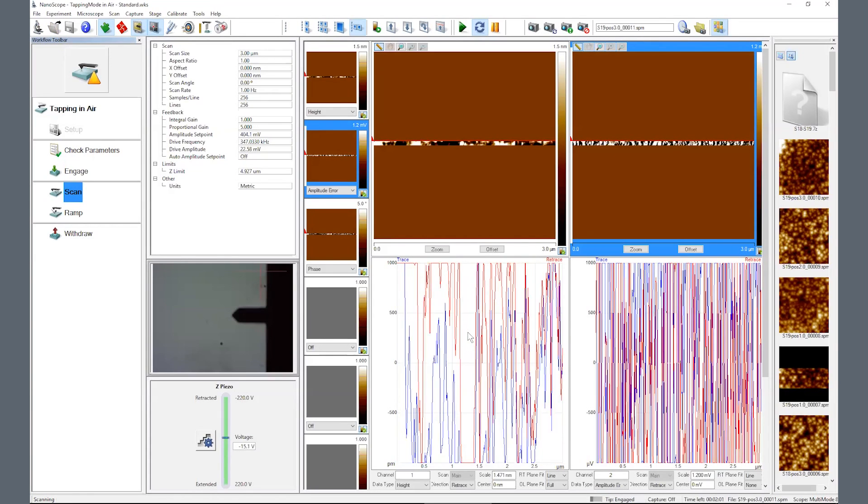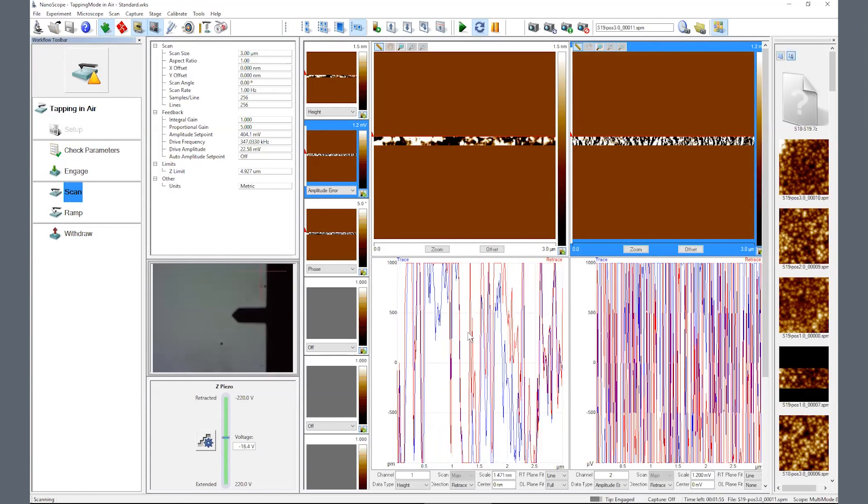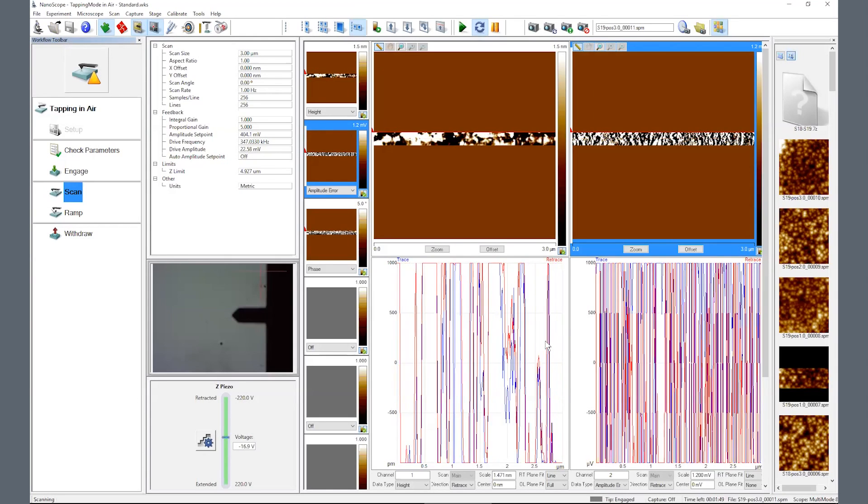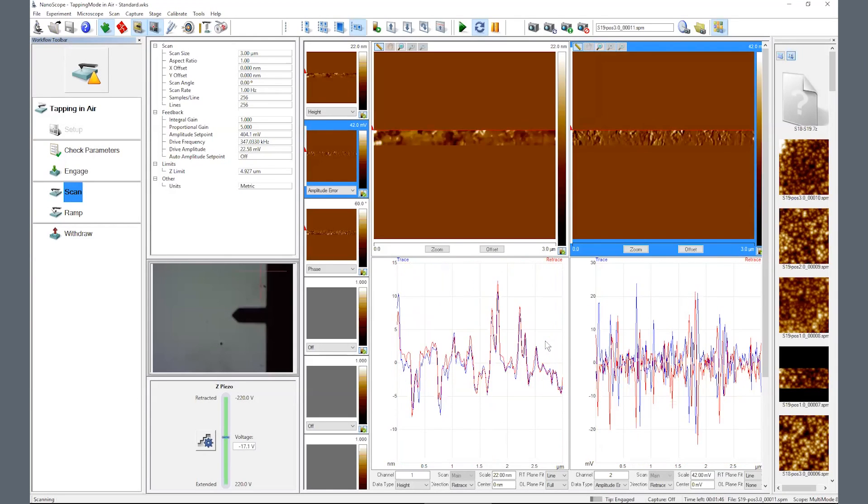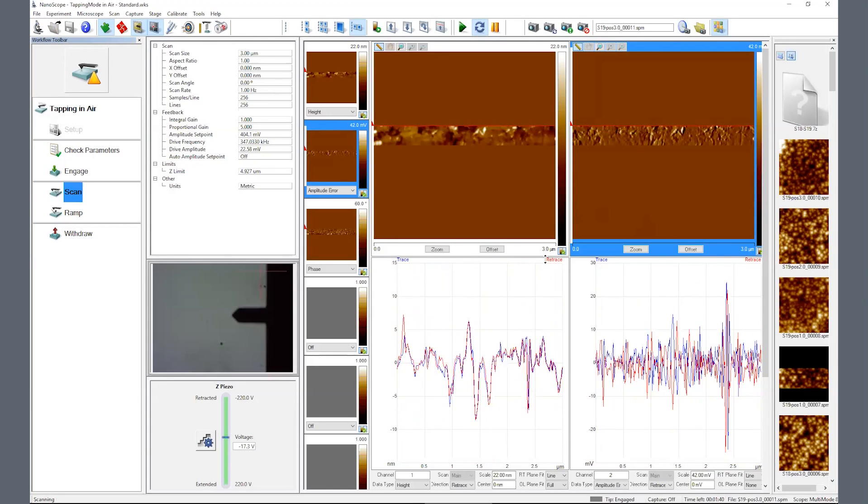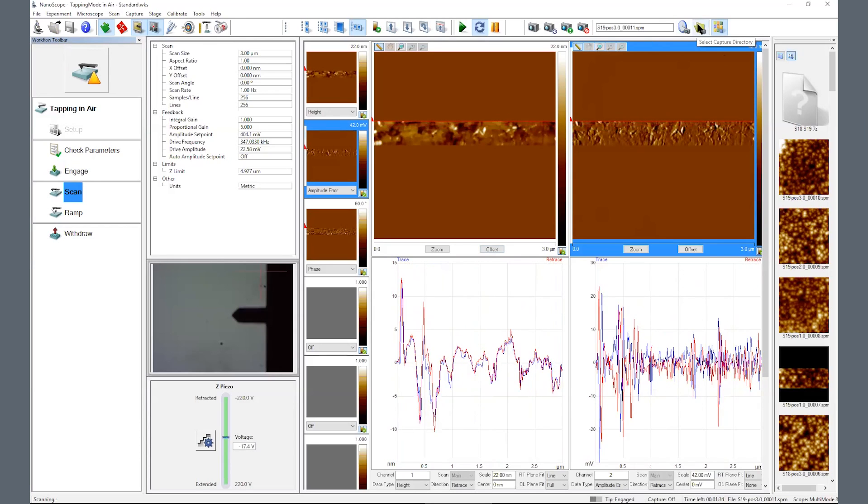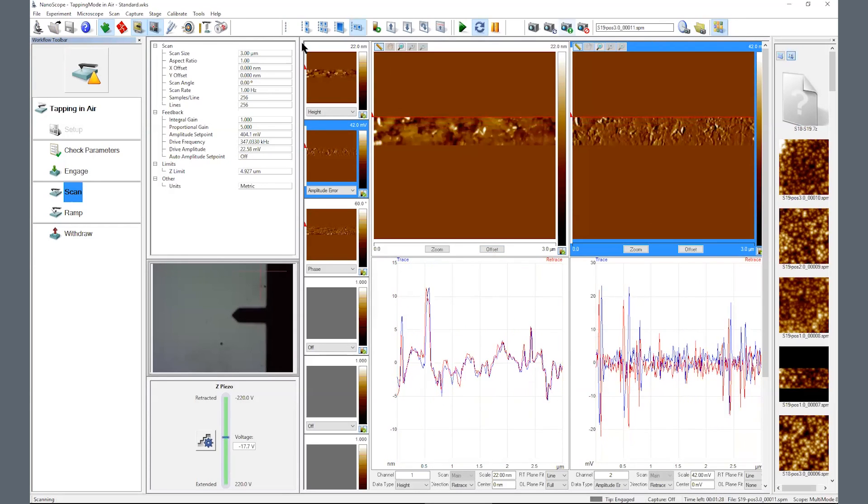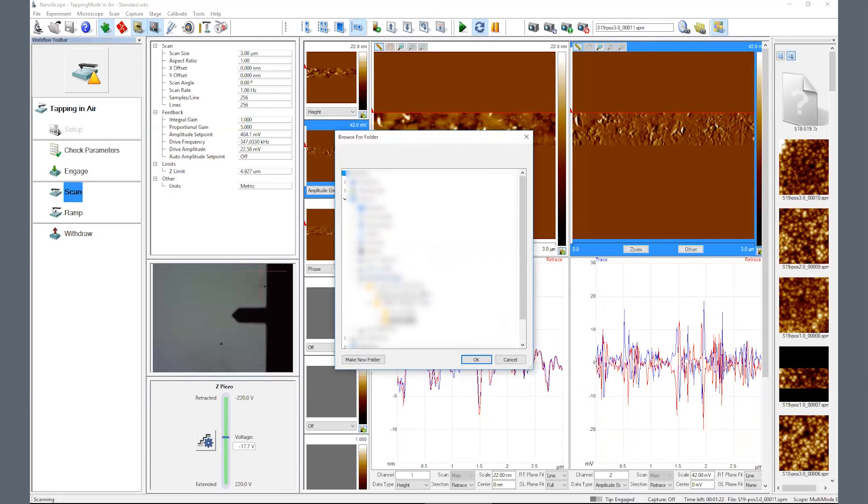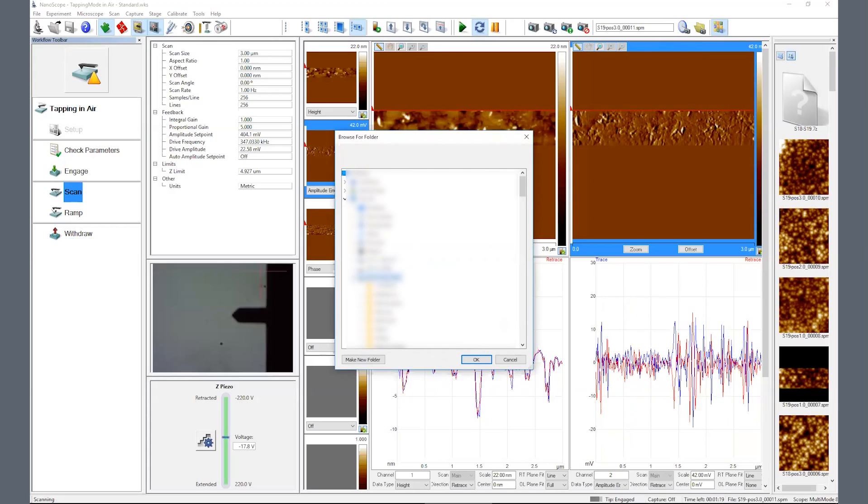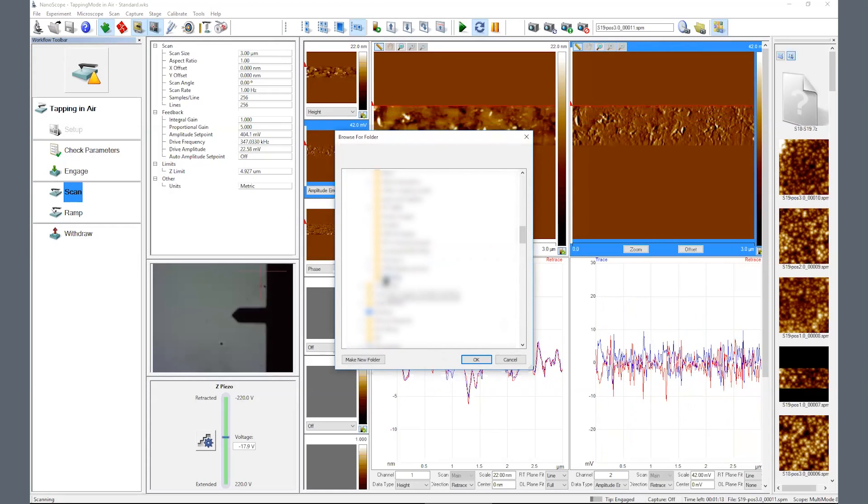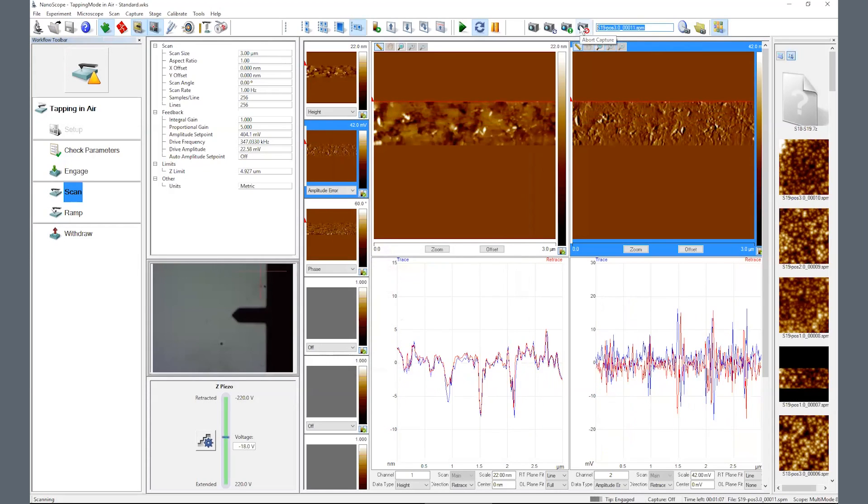You will notice the contrast will automatically adjust to accommodate the highs and lows of the sample morphology. You can overwrite this contrast by typing in a value in the scale field. As the scope settles in, click on the folder on the upper right to select or create your file saving location. Also, enter a unique filename for your sample and click enter.